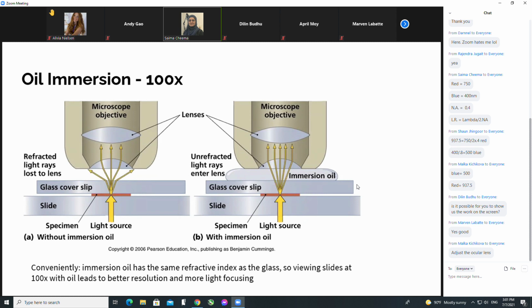We'll talk about that when we talk about staining, but you couldn't just swing in an oil immersion lens under dry conditions where you haven't put in the oil and expect to see a fine detailed image. It works only when you put the oil onto the slide. And notice when the oil is added, it's a continuous film.